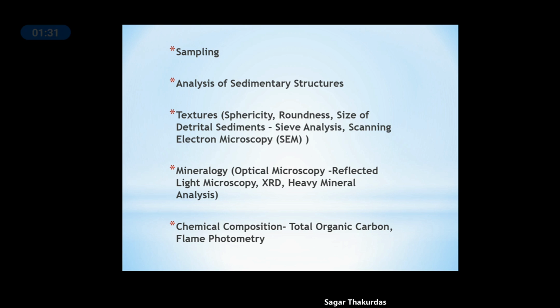within the rock sample. And this can be done with the help of mechanical analysis, that is sieve analysis, or you can go for scanning electron microscopy. And also optical studies like thin section preparation and observation of these thin sections under microscope can help you in studying the texture. Next is mineralogy. You can identify the minerals present within the rock sample, and this can be carried out by studying the thin sections under reflected light. And also X-ray diffraction.